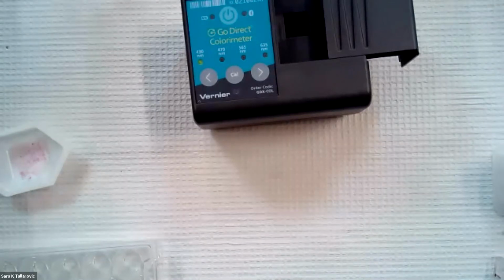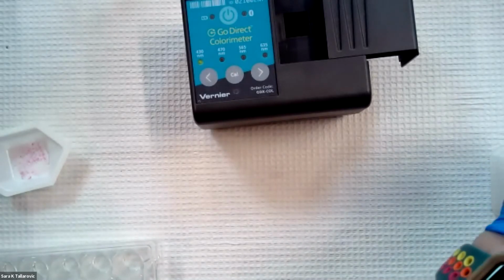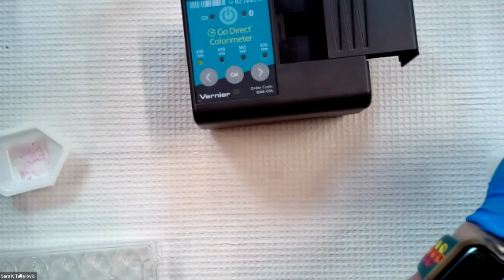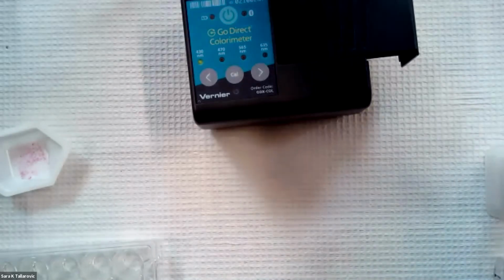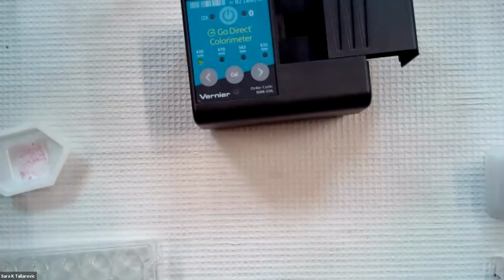What's nice about this prep is that students can really explore. I'm using sodium chloride, but students could certainly explore different types of salts if you have them available in your lab. I just used plain table salt for this prep today, which is the main prep that's in the book. You have a lot of freedom with inquiry in this lab if students would like to design their own experiments.